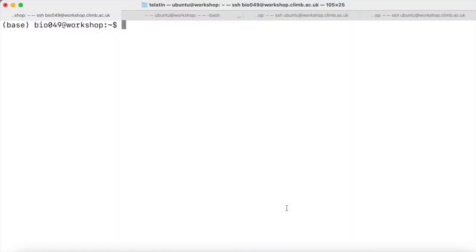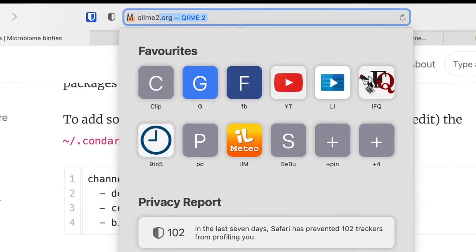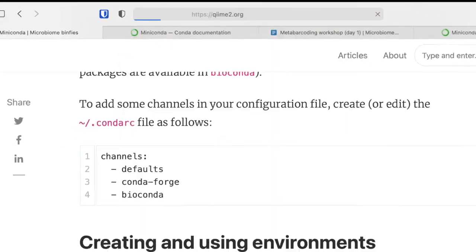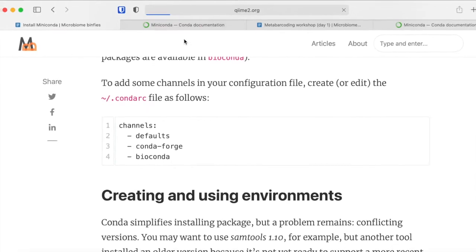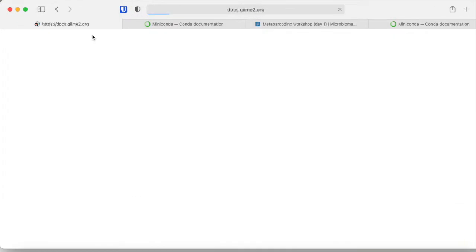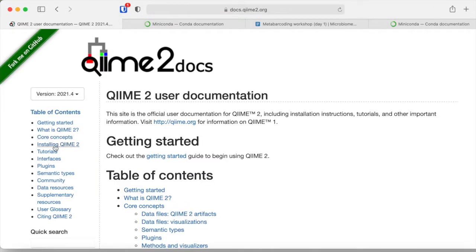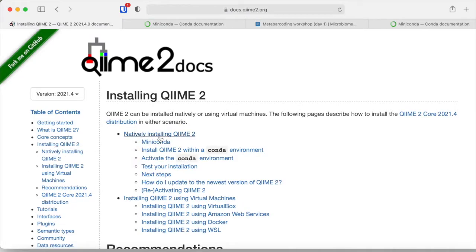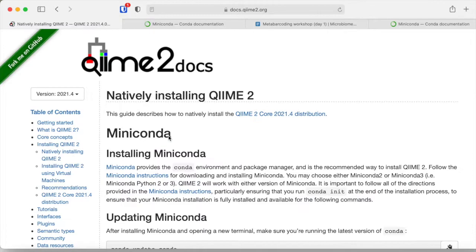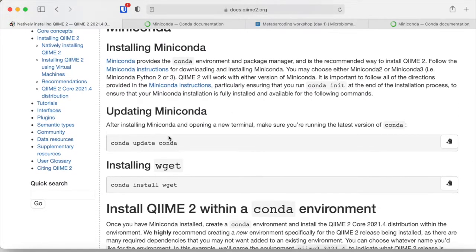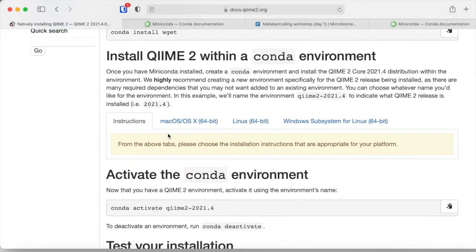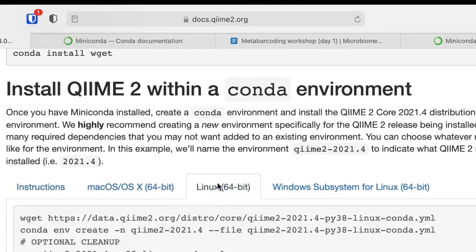Now we will see how to install QIIME 2 after we installed Conda. The QIIME 2 website has installation instructions under the documentation. We can go to Installing QIIME 2, natively installing QIIME 2 with Miniconda. Since we have Conda, we can follow the instructions for either Mac OS or Linux.